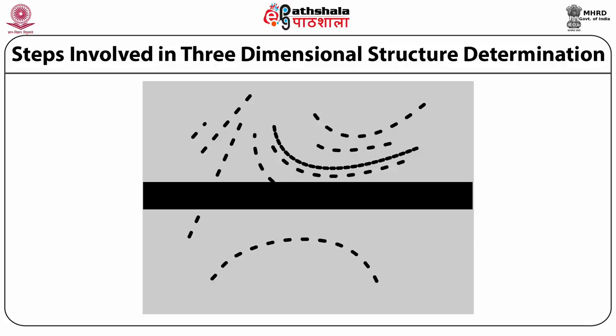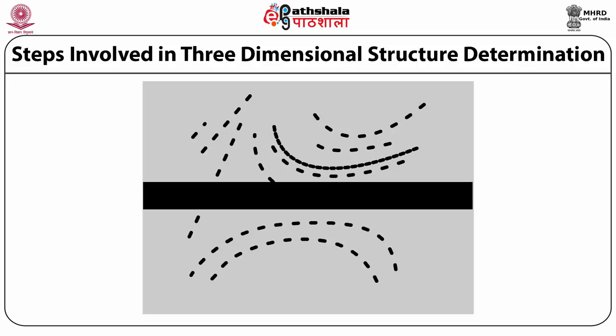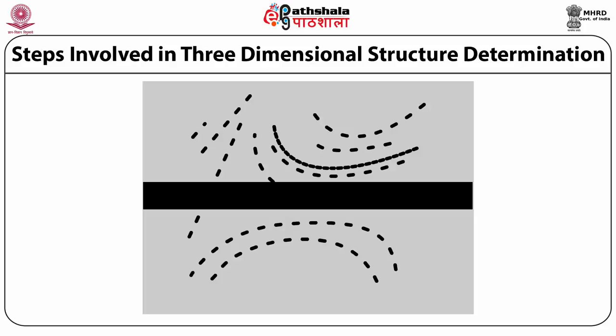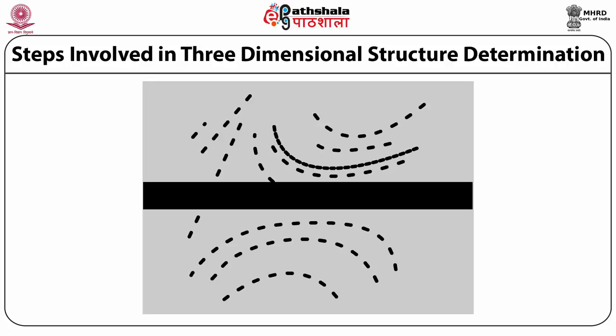This is a picture known as a Weissenberg photograph, where the pinacoids and festoons are shown. A pinacoid is just like a straight line going, and the curved arcs are known as festoons. This is called a layer photograph, where the crystal is rotated and the film cassette also has a translation movement. This is how they scanned the entire film to obtain the Bragg intensities of all reflections coming out of the unit cell.